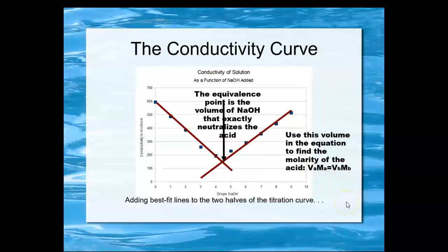This is a very critical type of experiment we're going to use as we treat the barium hydroxide and sulfuric acid, and the sulfuric acid is added to the barium hydroxide to form barium sulfate.